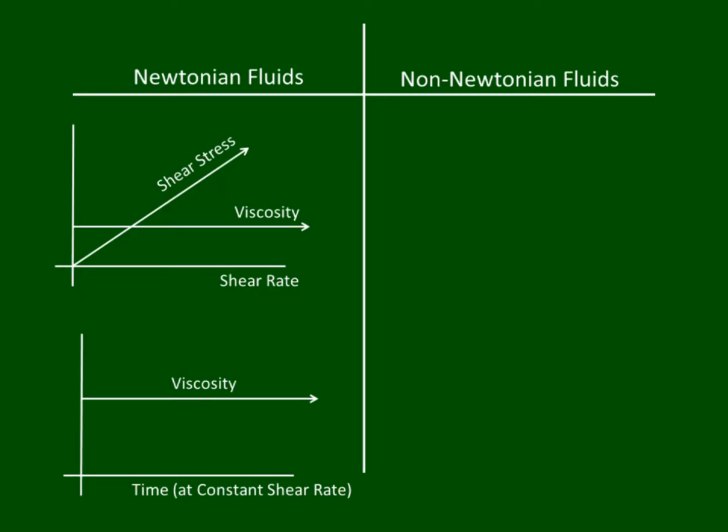In this video we will take a look at some interesting behaviors of non-Newtonian fluids using the Viscometer in our nano-analytical lab. Fluids can be characterized in different ways depending on their physical properties and how we model them in fluid mechanics. Fluids can be first characterized into one of two categories, Newtonian or non-Newtonian.